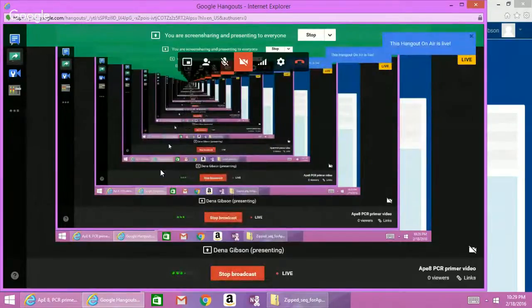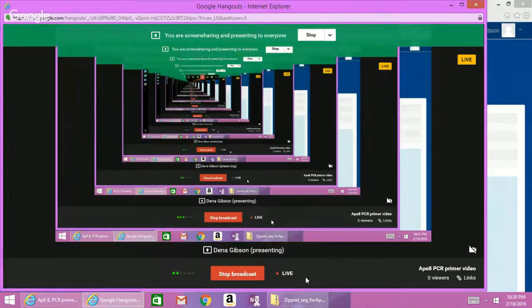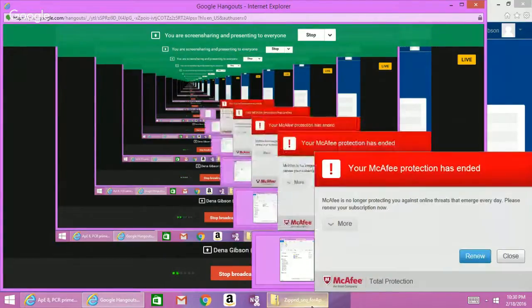Hi, in this video, I will be using APE to do a PCR primer analysis. Okay, let's get started. First, I'm going to download a zip file from Moodle that contains our wild-type MSH2 gene and an unknown mutant of the gene.